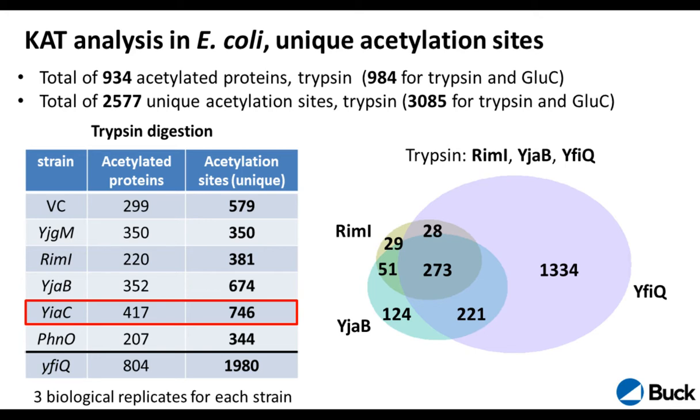And the reason for that is that one just cleaves with different chemistry. Here at the lysine, either you do trypsin, lysine, arginine, or gluC, aspartic acid and glutamic acid. So you cover other areas of the protein.